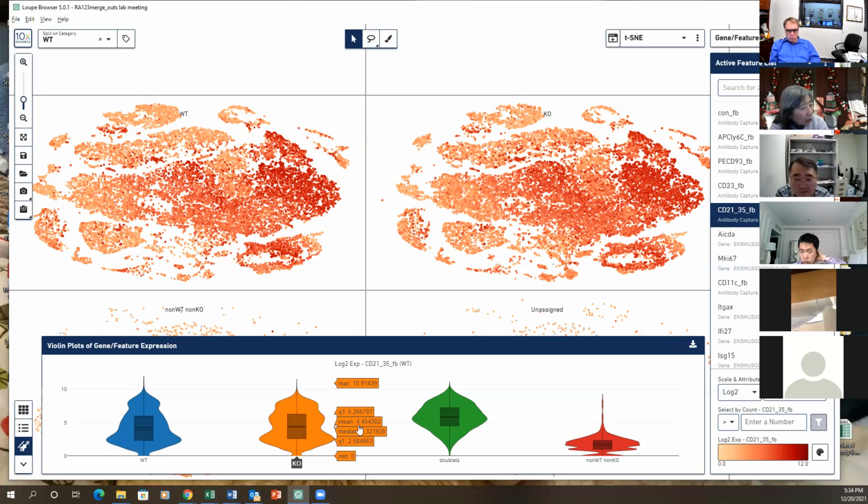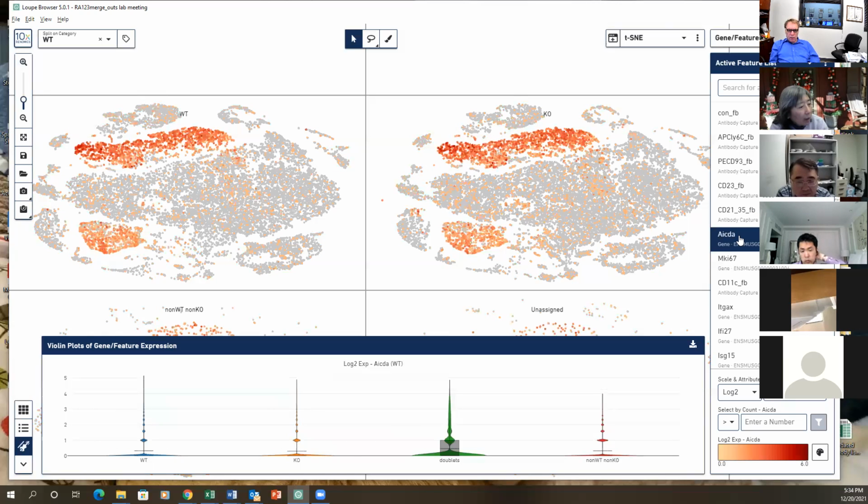This is 4.5, this is 4.3. But this is quite a lot of cells, so probably this one will be significant. This CD21 is definitely higher. Why does the double get so many things? Because it's a doublet. Everything is just, I think, a doublet. So the gene is kind of like that: when it's a doublet, it's twice as high to begin with.